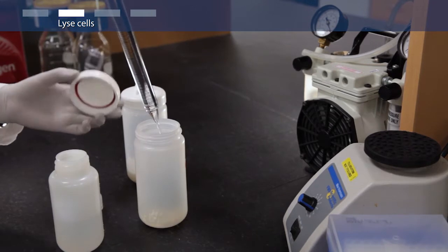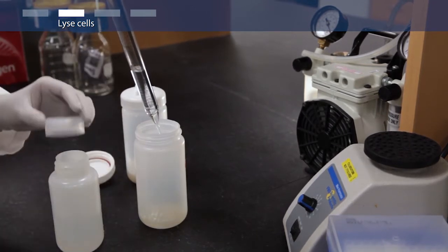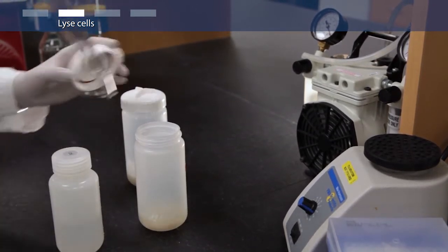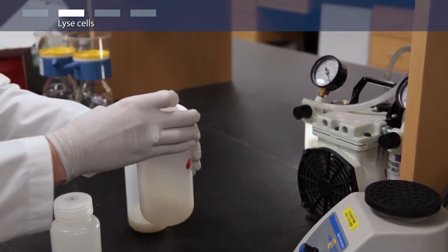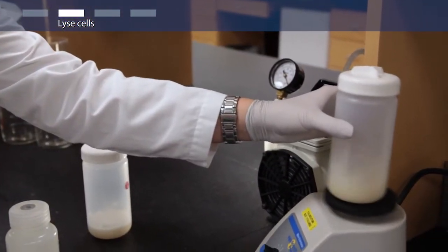Add 50 milliliters of resuspension buffer with RNase A to the cell pellet. Vortex until the sample is homogeneous.